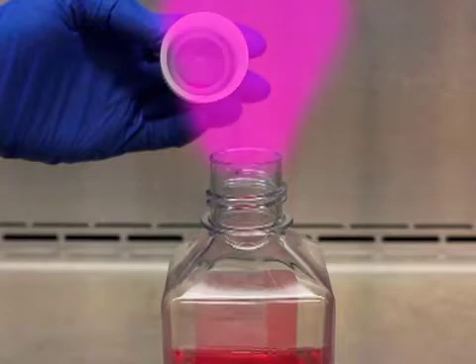So it's important to learn how to avoid passing your hand or arm or pipetter through the zone directly above the vessel. It's also a good idea to minimize the time any vessel is open, so as soon as you've transferred the needed reagents, recap the vessel immediately.